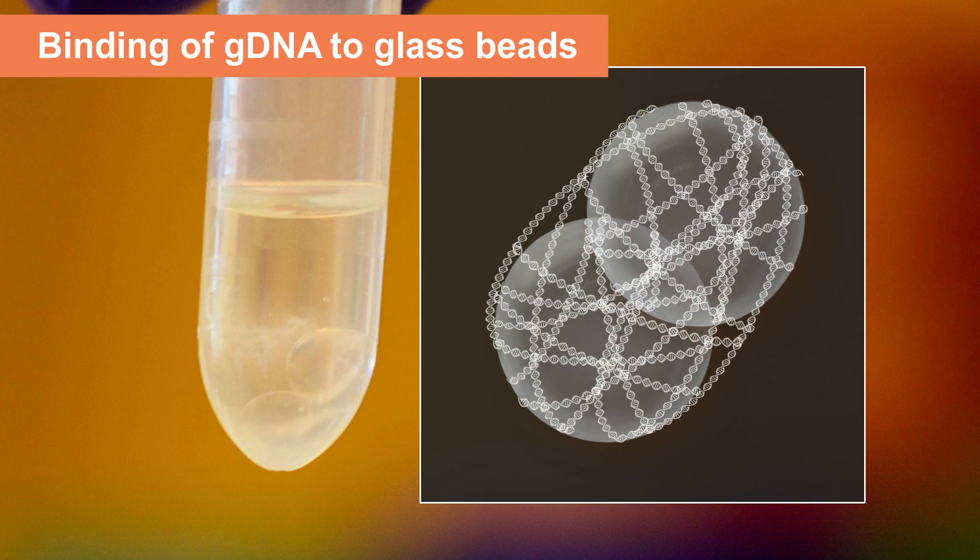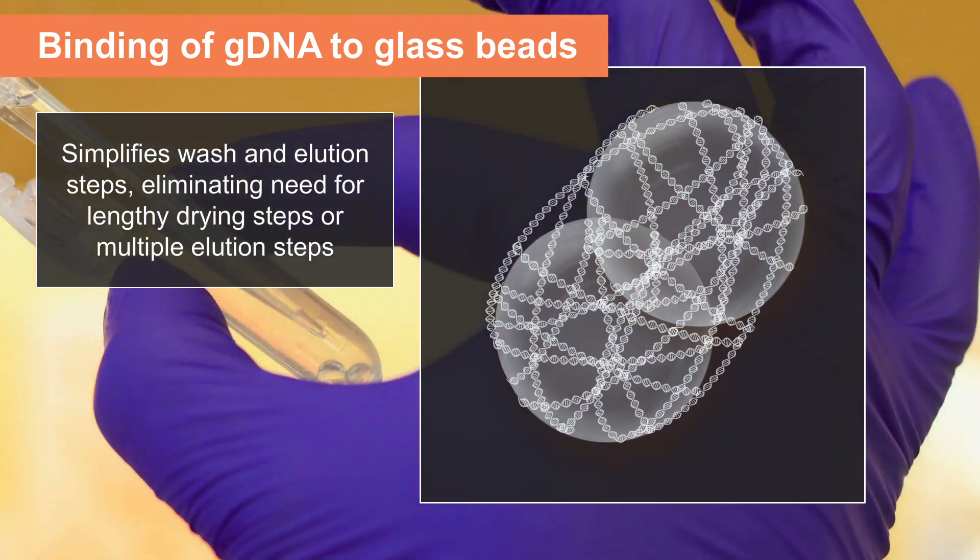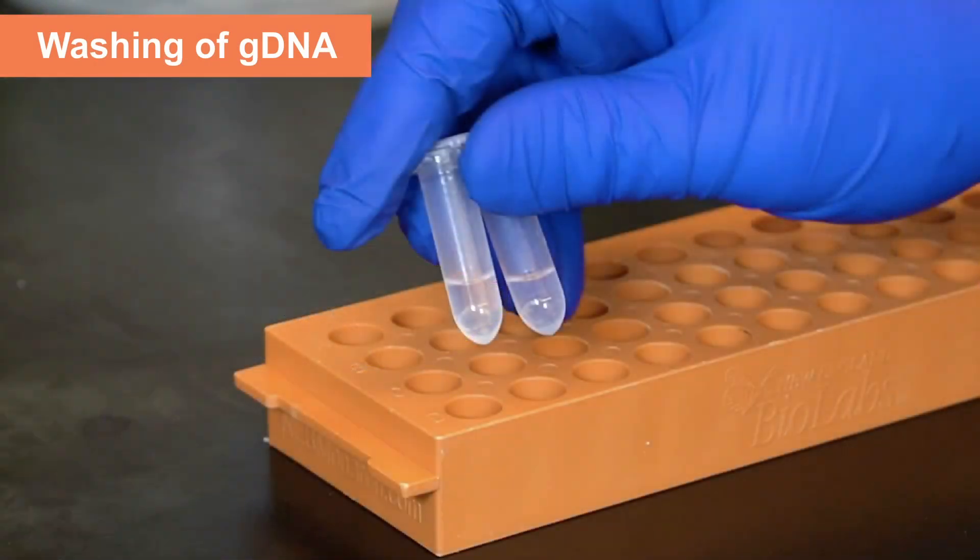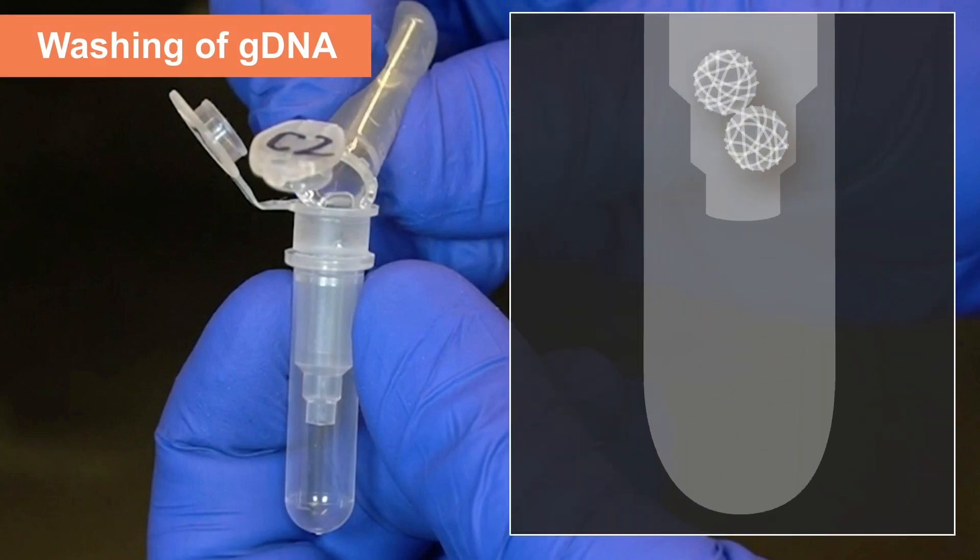Capturing the DNA on the glass bead surface simplifies the wash and elution steps, eliminating the need for lengthy drying steps or multiple elution steps. After wash buffer is added to the beads, the beads with the DNA bound to them can be poured into the bead retainer, which holds onto the beads while a short spin quickly removes all traces of wash buffer and dries the DNA.